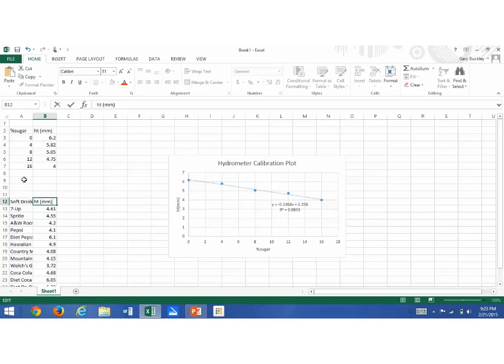What I'm going to do over here is just pick a box out. It doesn't matter which one. I'm going to type those values in here so I have them to work with. So I'm going to type in the slope and intercept so I know where they are. And when I come up to the slope, it was negative 0.1368. If your slope comes out negative, let it come out negative, that's fine. If it's positive, put positive. But make sure you get the sign right.